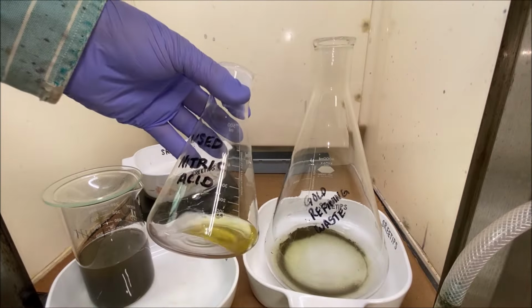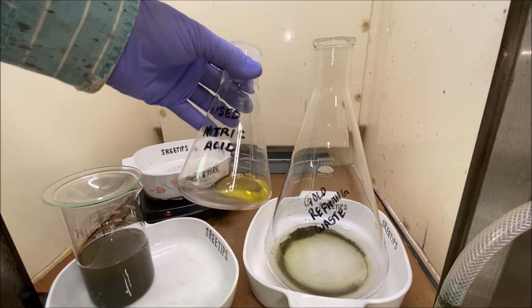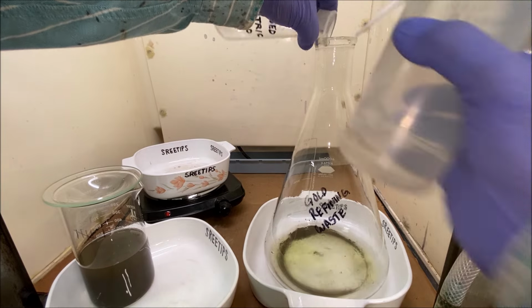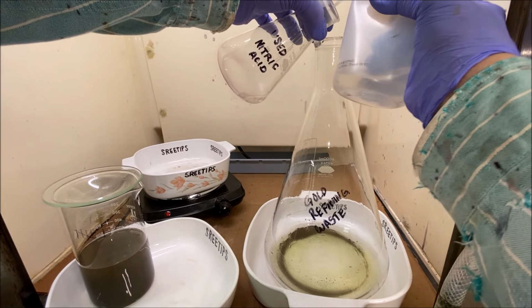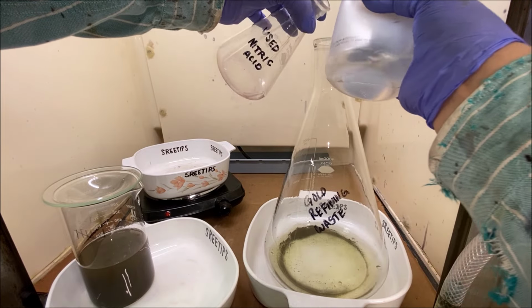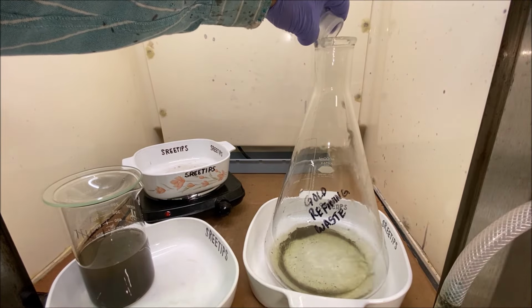Had a little gold in the bottom of this container as well, and I dissolved it out with a little bit of aqua regia. Put that in our waste container. We can get this gold out of this waste container later on.